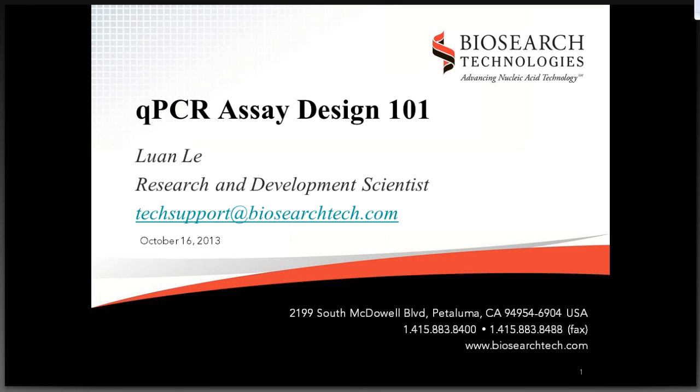That's actually a good question. You might have certain limitations. One is going to be the multiplex itself. The other is going to be the instrument you're using. Certain instruments don't have the spectrum to differentiate between different probe types. We've seen certain instruments where you can multiplex up to 5 dyes as long as they have 5 different filters or 5 different settings to differentiate between each dye label. So we do offer a wide variety of fluorescent dye options so that you can multiplex.